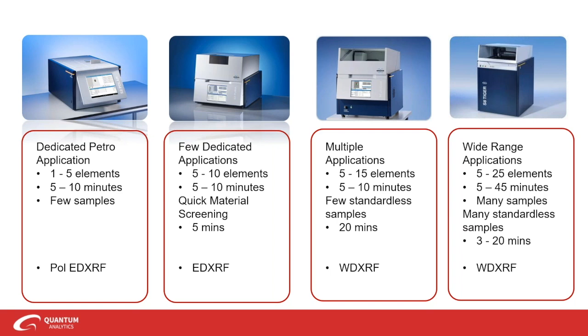Depending on what you're running and how many elements you're looking at, they may take more time. But you have more capability for running standardless analysis. And the timing, even on the far right side with the Tiger, is a much faster analysis for these standardless types of samples.